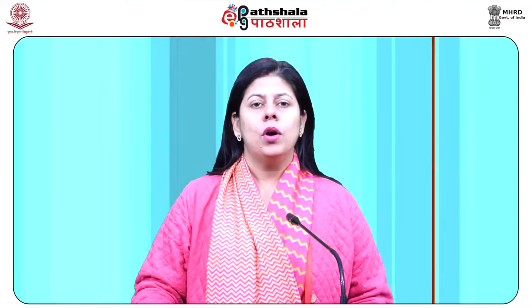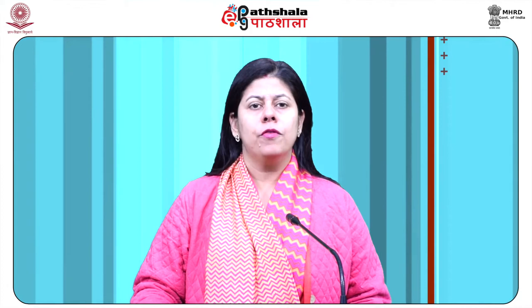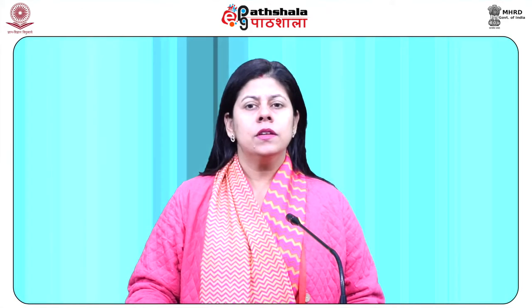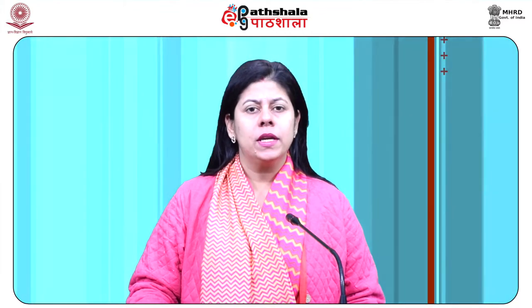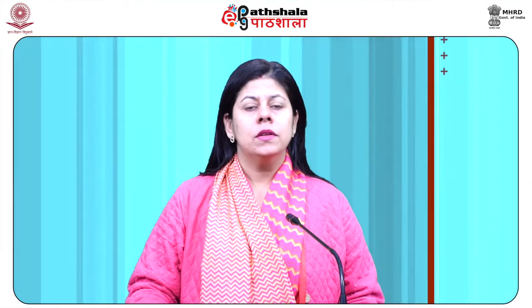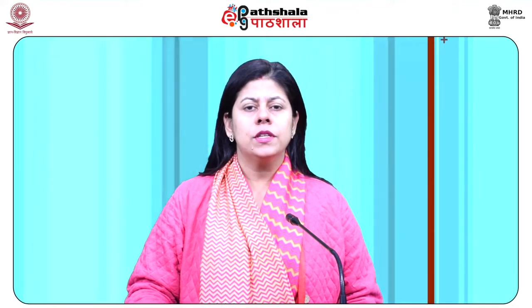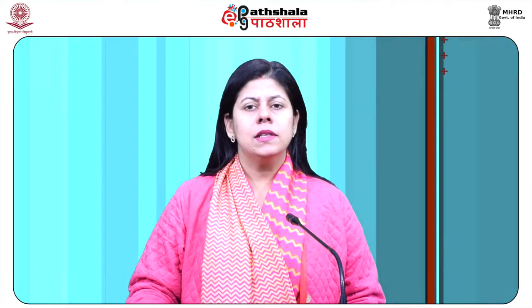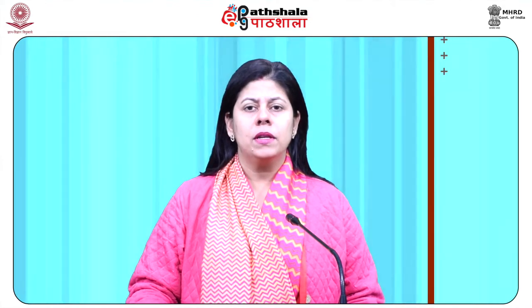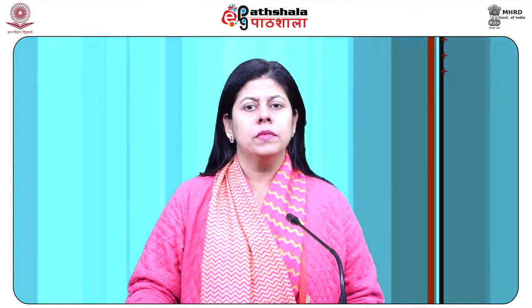Fluorescence microscope. Modern biological microscopy depends deeply on the progress of fluorescent probes for specific structures within a cell. In contrast to normal transilluminated light microscopy, in fluorescence microscopy the sample is illuminated through the objective lens with a narrow set of wavelengths of light. This light interacts with fluorophores in the sample, which then emit light of longer wavelength. It is this emitted light which makes up the image.